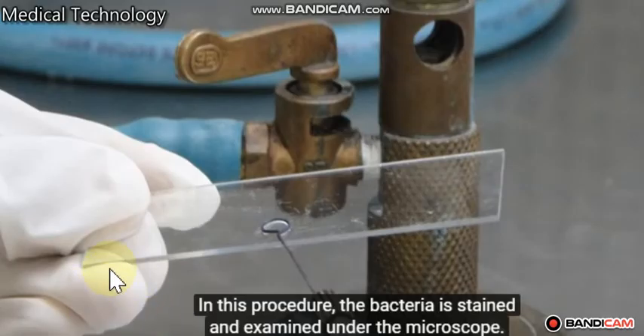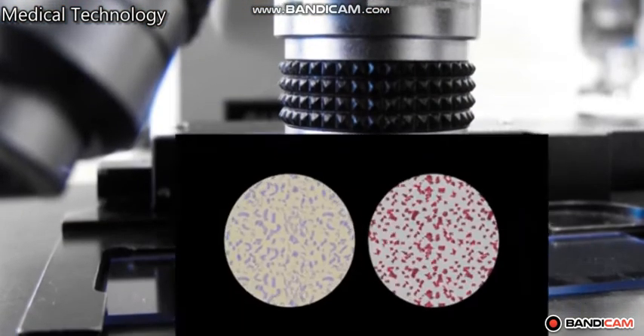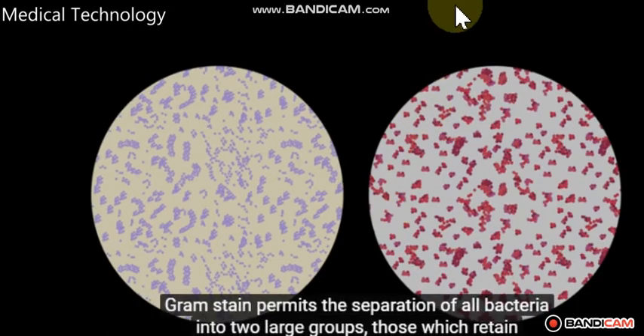Here we can see the video about how to prepare the bacterial dried smear from solid media. Look — this is the Gram-negative here.